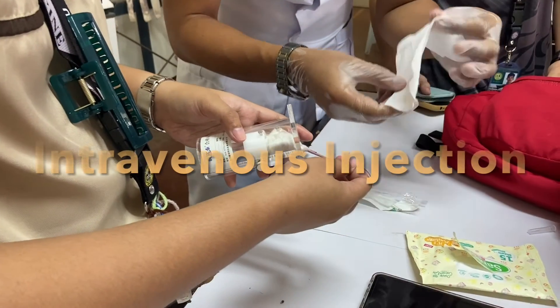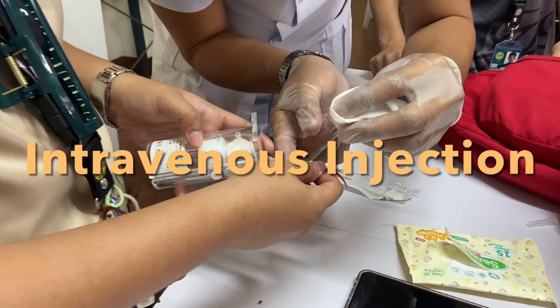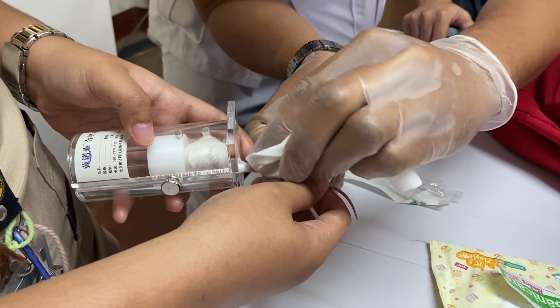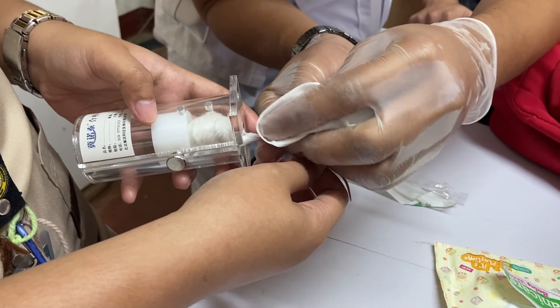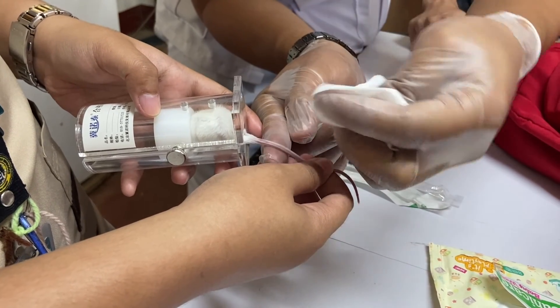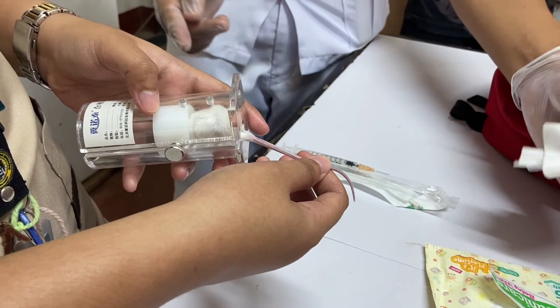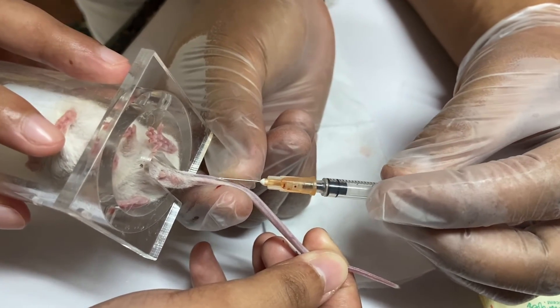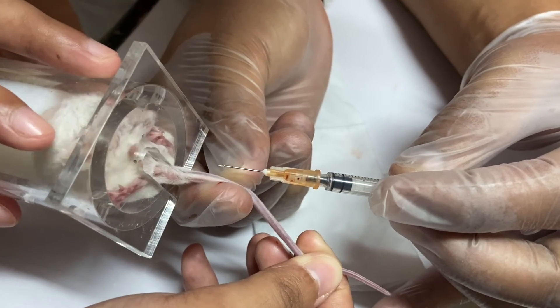Intravenous injection: restrain the mouse with the aid of a tail-first restrainer. Warm the mouse using a lamp to dilate the tail vein. Disinfect the tail with sterile pads with alcohol and dry it with a sterile pad. Insert the needle at the caudal one-third of the length of the tail through the skin and into the lateral vein.